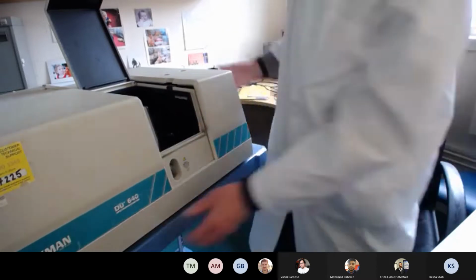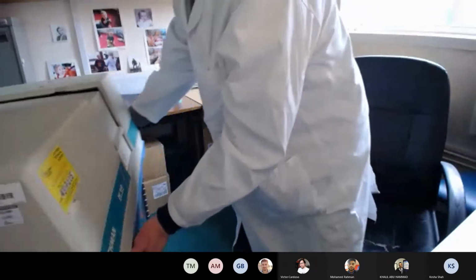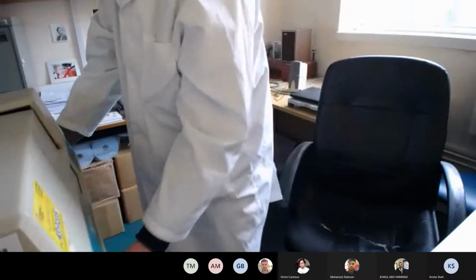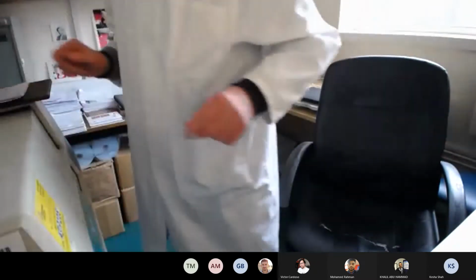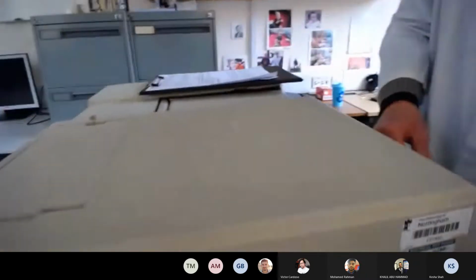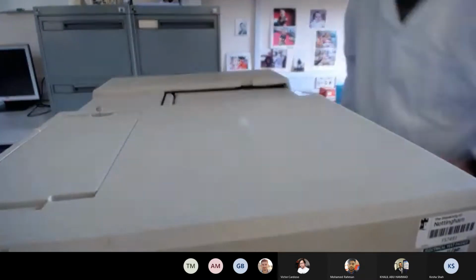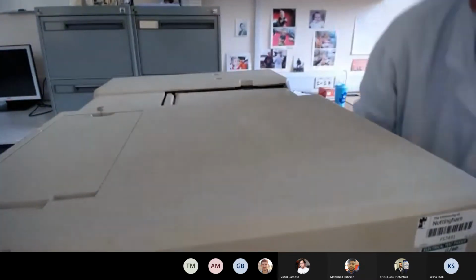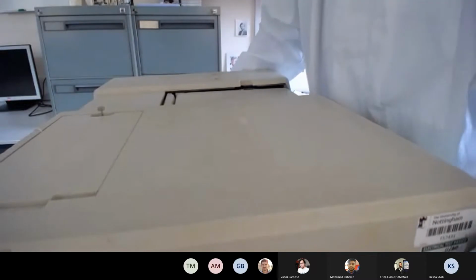Let's just juxtapose this round a little bit and then move. Okay. Right, I'm going to take the lid off. Again, I'm assuming you can see that. I've got this tiny screen here, which indicates what you can see. Let's get rid of the lid.